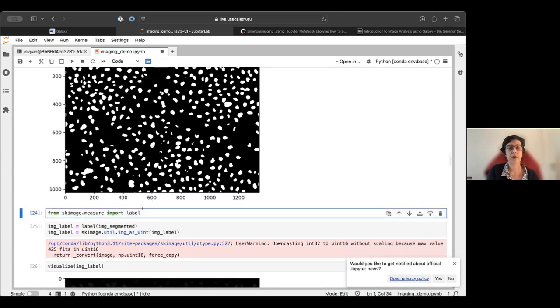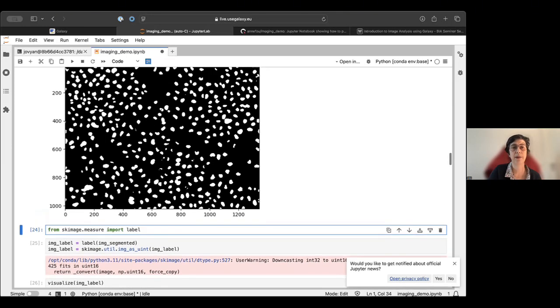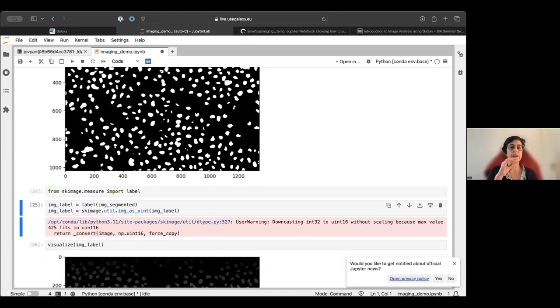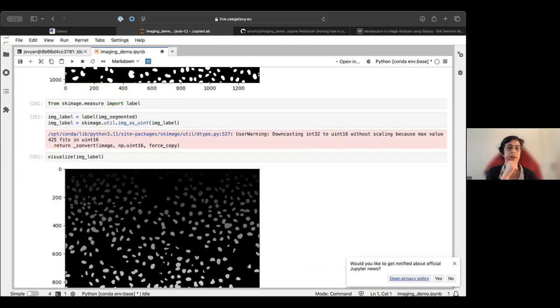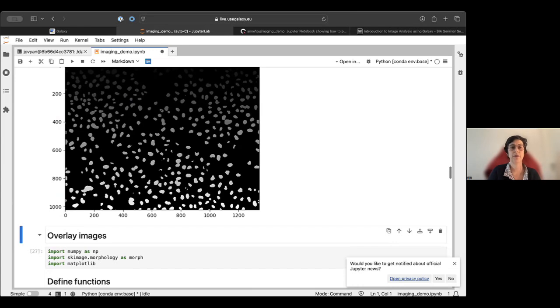So here, again, we can do this labeling as Leonid did, where we can give a label, a value, for each of the cells here, using this skimage measure label function. And again, I will run it as usual, and I can again use my visualize function. And similarly, here we have exactly the same as you had, where it's not always very clear, but we have one color for each of them.